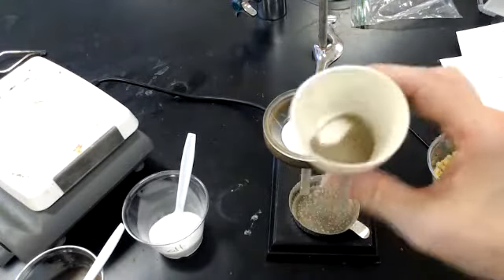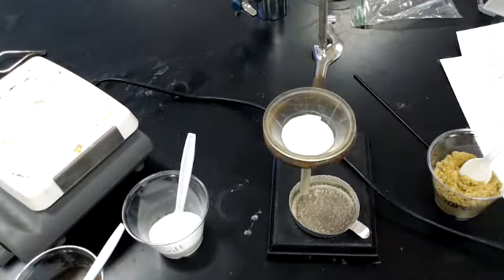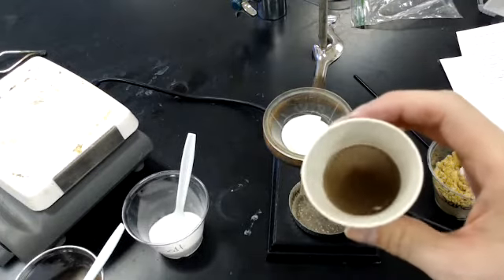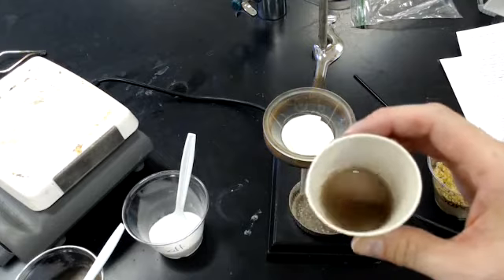I'm going to take what's in my little cup here and add some water to it. Okay, so I've added water to it. I'm trying to swirl it around, make sure everything that can dissolve will dissolve.